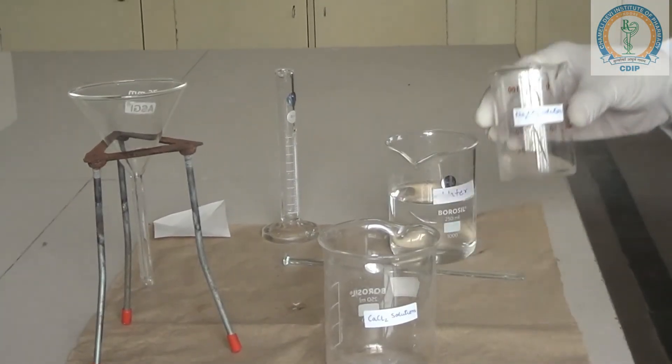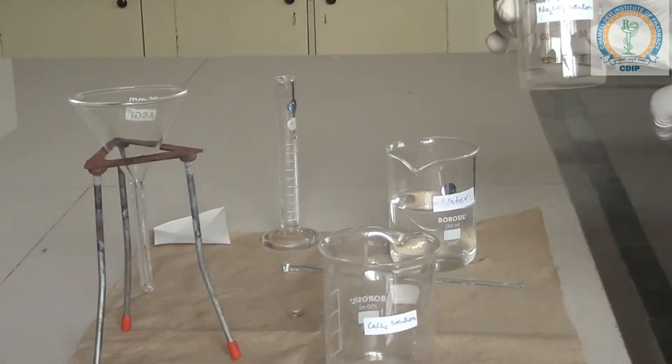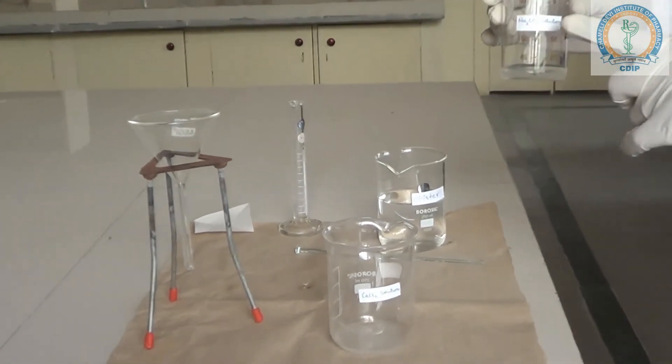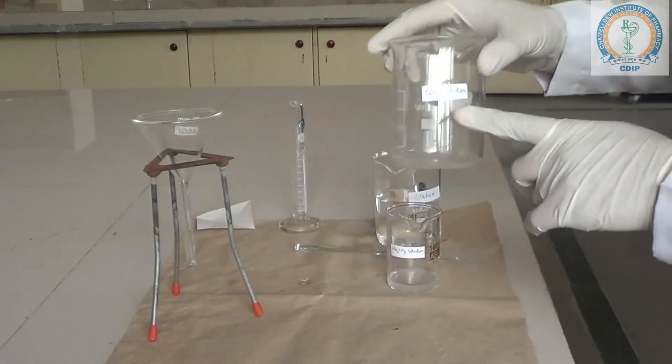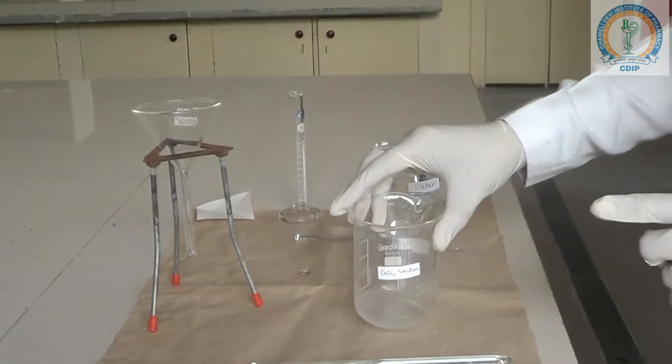Now, these are the different solutions: Na2CO3 solution, which we have prepared by adding Na2CO3 in distilled water, 10 ml. And this is the calcium chloride solution. Both the solutions are clear now, properly dissolved.